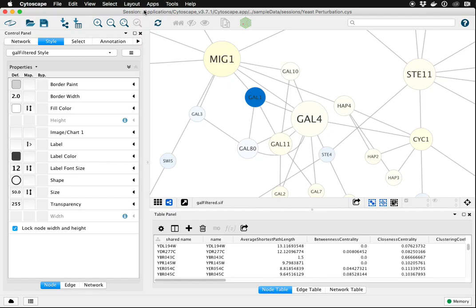This is Cytoscape 3.7.1 and today I'm going to show you how to improve node labels to make them more visible in particular situations.